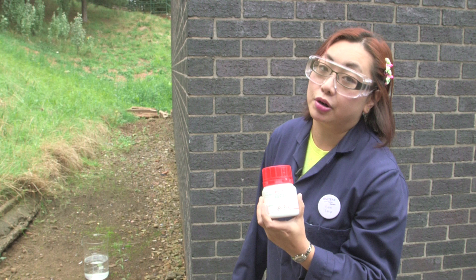It produces sodium hydroxide, which is a base, and that will therefore turn the solution pink.